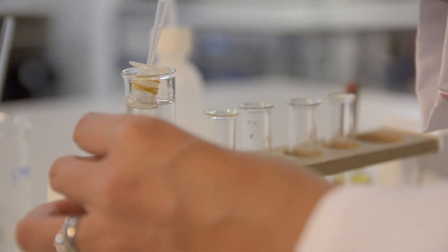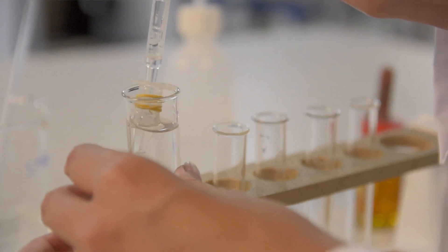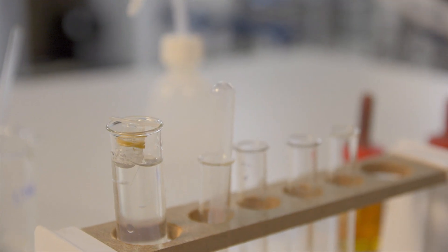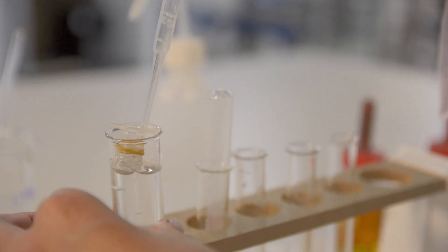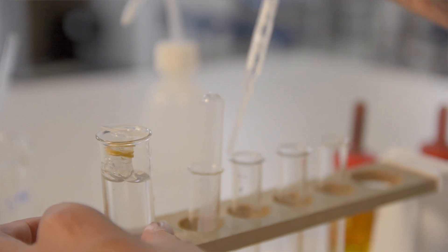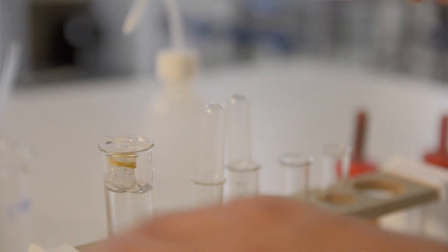I'm going to take a sample straight away from inside the visking tubing and one from the water surrounding it. At this stage, you probably want to ask your students to predict which of those samples will contain starch or glucose, and you can also ask them to remind you of how you test for the presence of those two molecules.